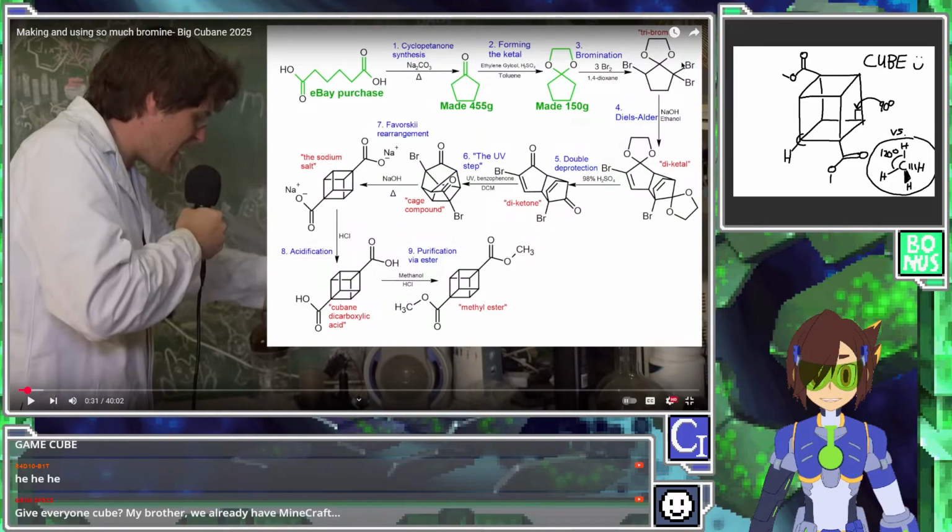And then this is where the bromine comes in. Well, this is the step where the bromine comes in, and he needs to make the bromine, and then maybe he'll also do the step to make this next organic molecule here today. I don't know. It's a 40-minute video. We'll see how long he takes to make bromine. And then there's further steps, but I'm sure I'll probably end up reacting to other videos in this series as he makes them, so we'll have time another day to discuss all that.